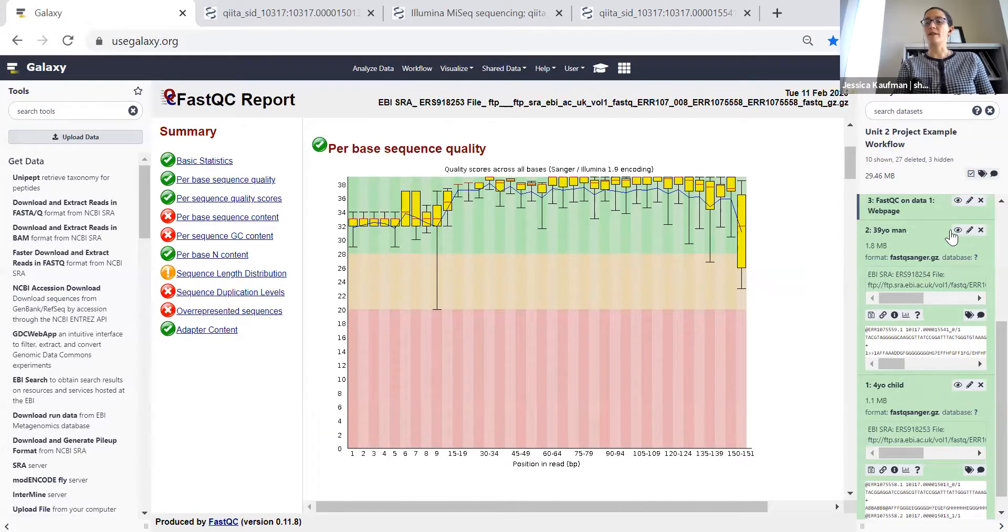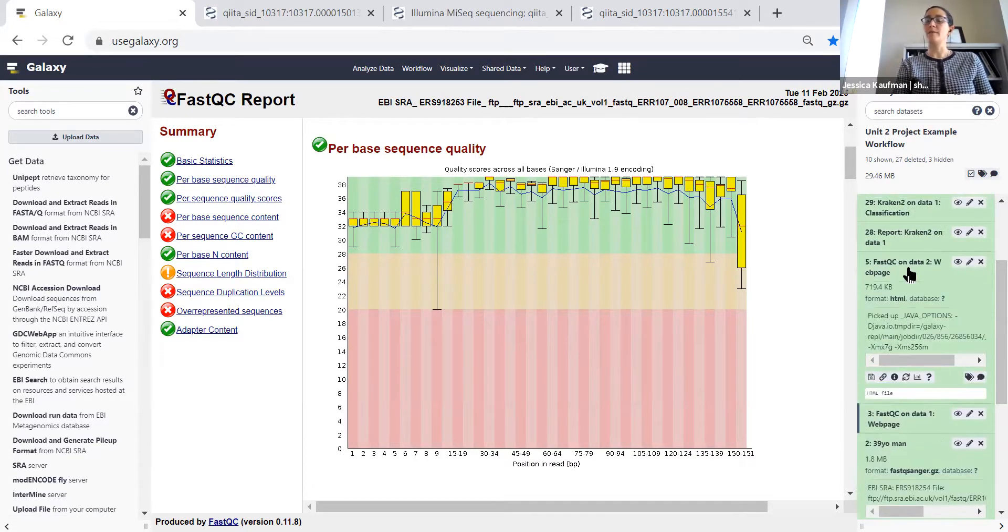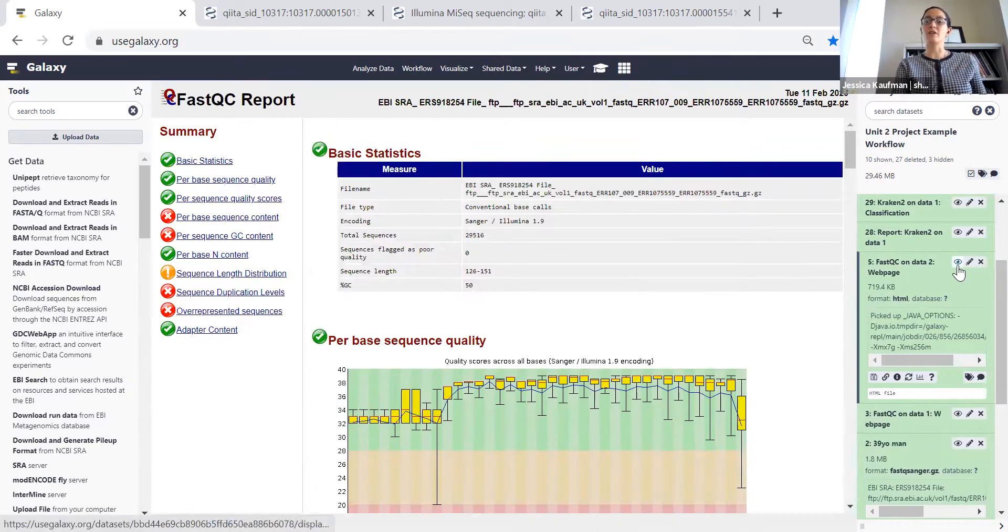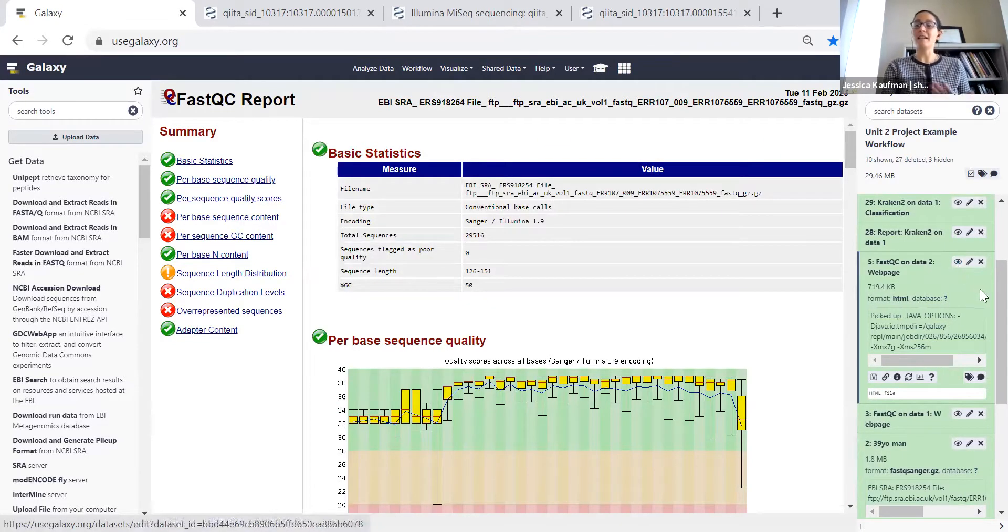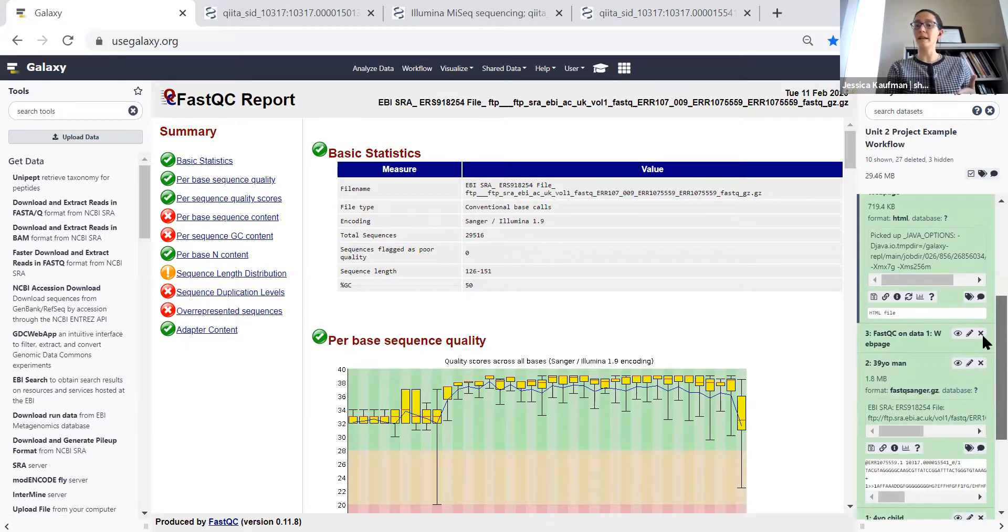When you run the FASTQC report, you'll probably see that the quality is really good. But for step two of the project, I still want you to try Trimmomatic, see if you can improve the quality of your samples a little bit.